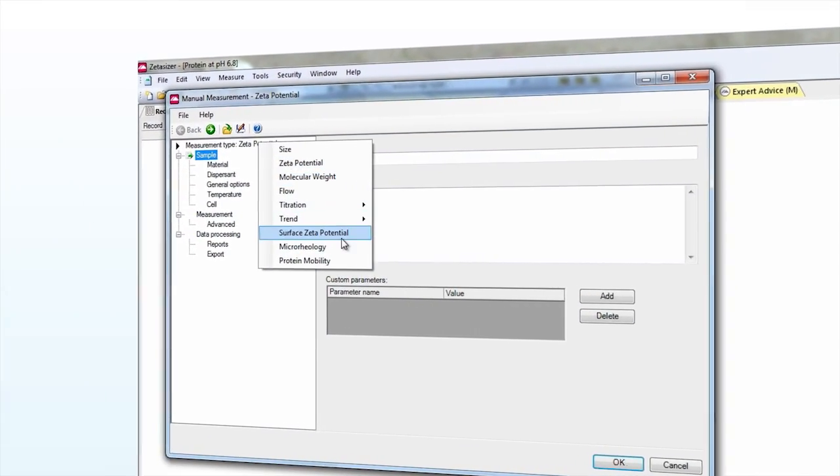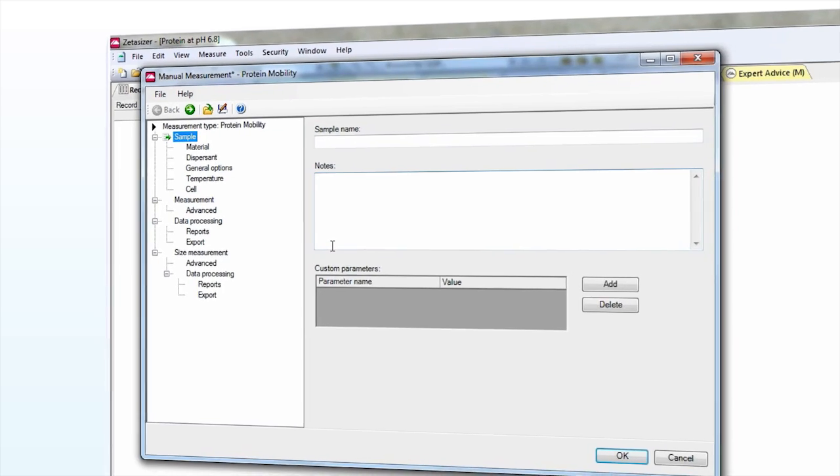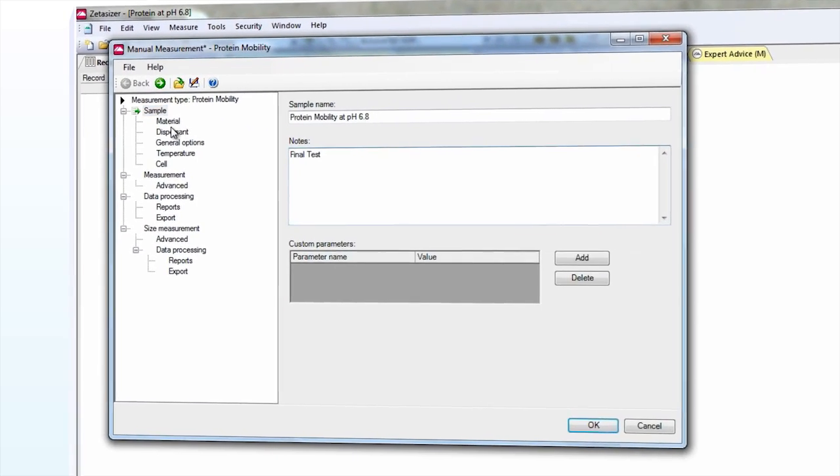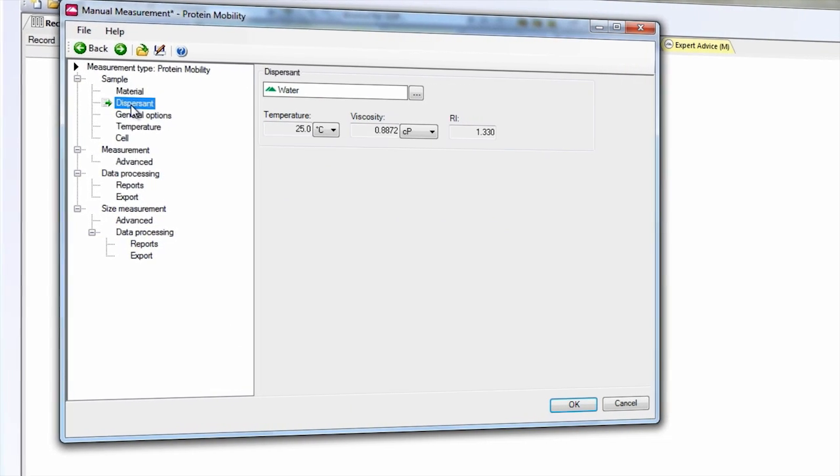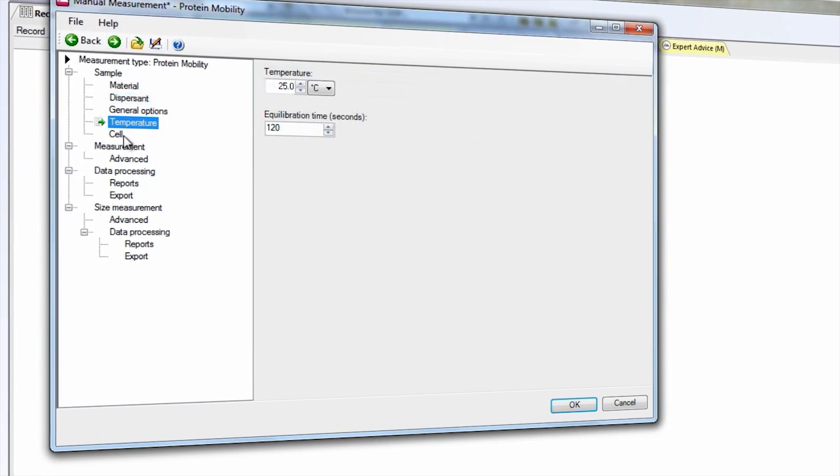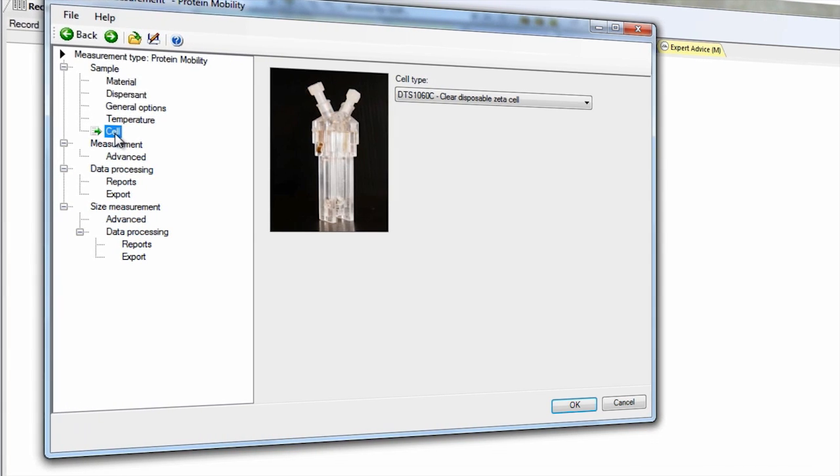After selecting the Protein Mobility Standard Operating Procedure from the drop-down menu, the preset operating conditions appear. As you can see, no user intervention is required to start the measurement. It also shows you which measurement cell to use.